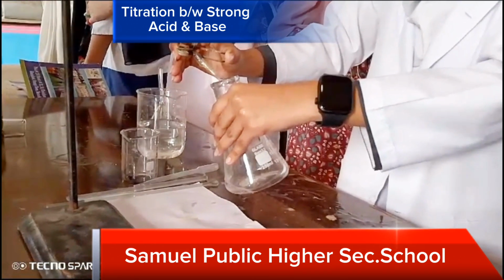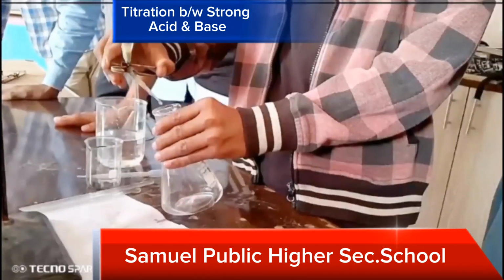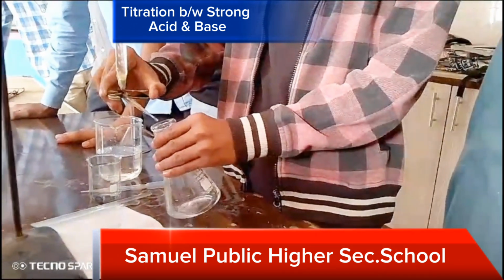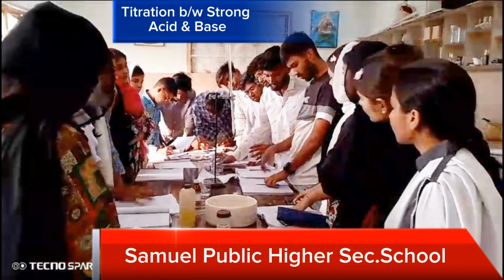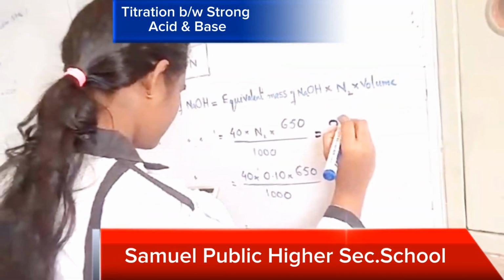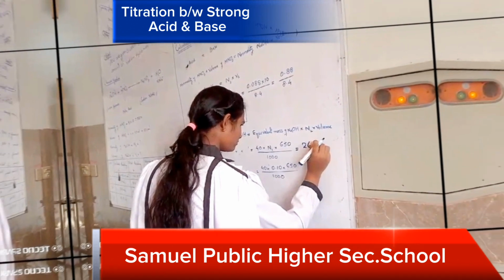In this way, repeat this process 2 or 3 times and find at least 2 similar readings. After this procedure, find out the normality or the molarity of the required NaOH solution by the formula.